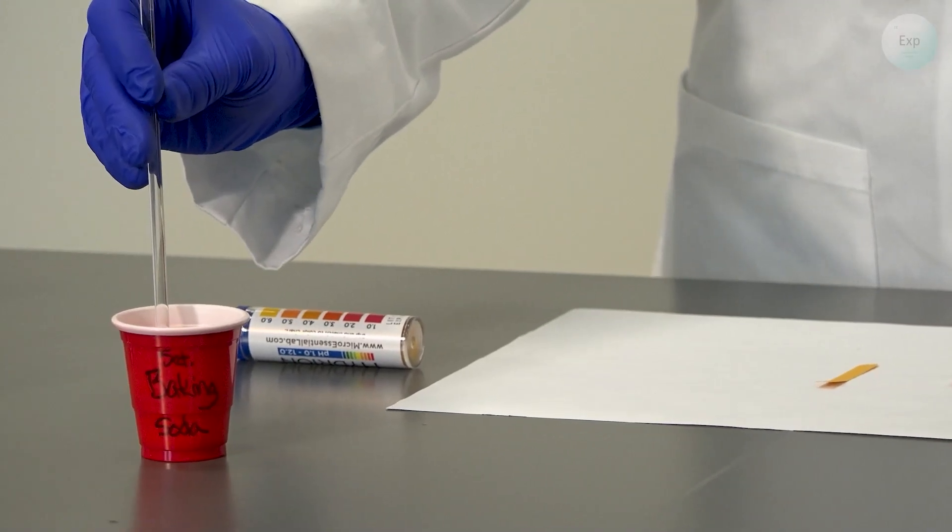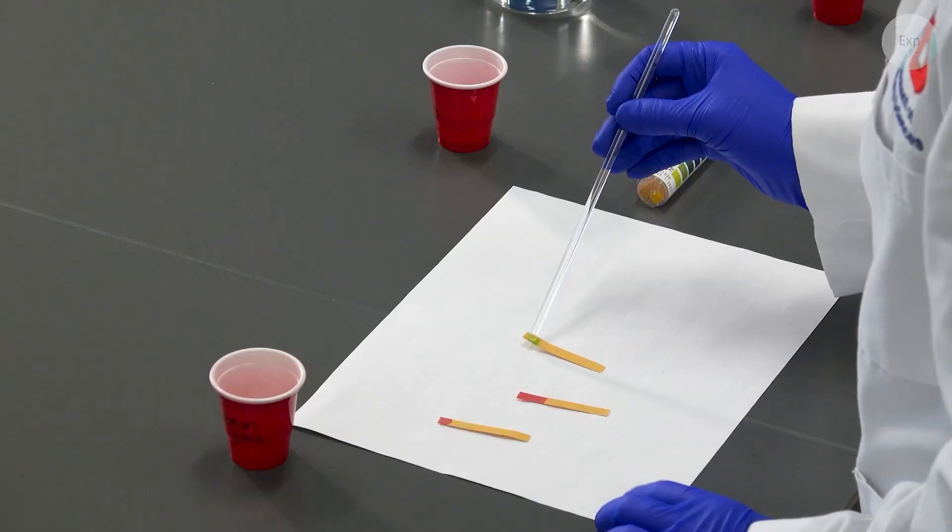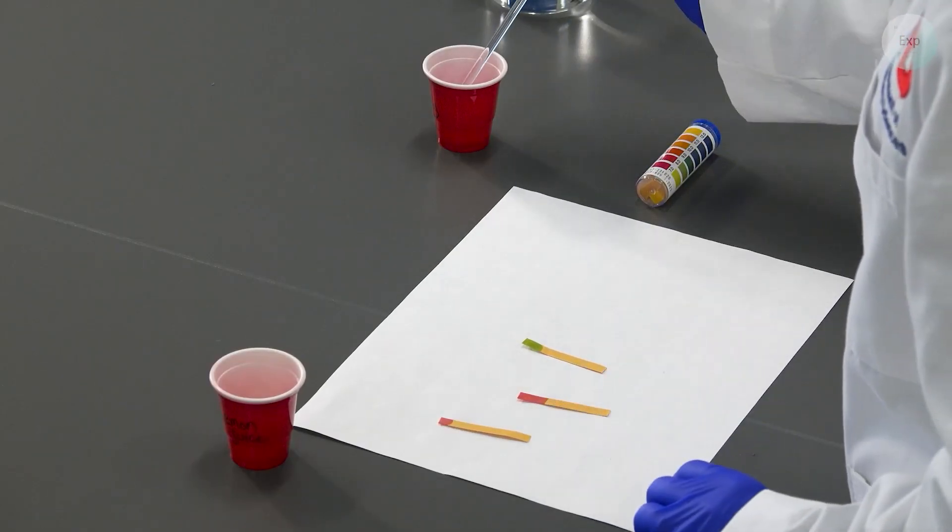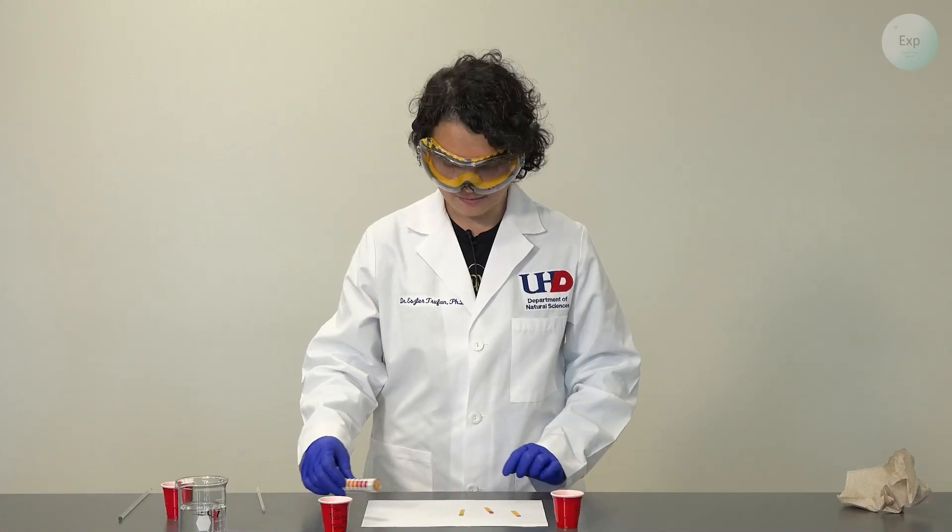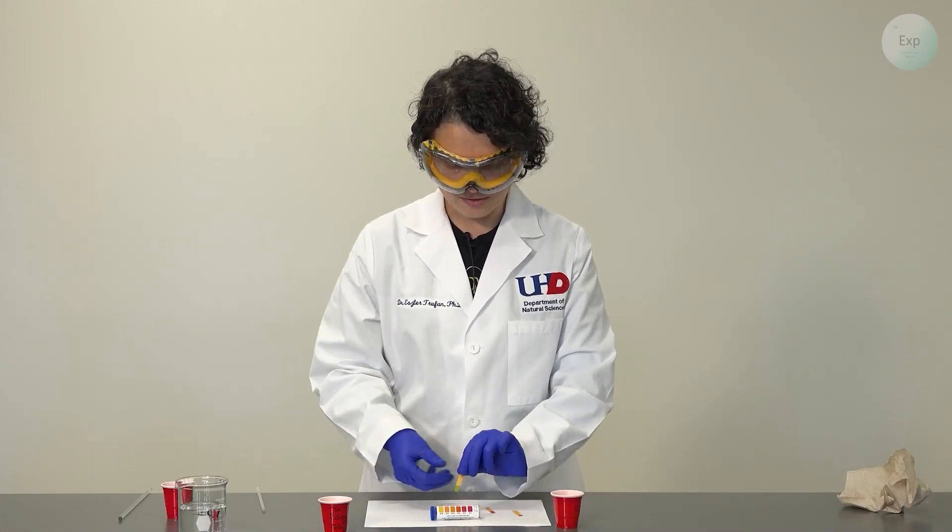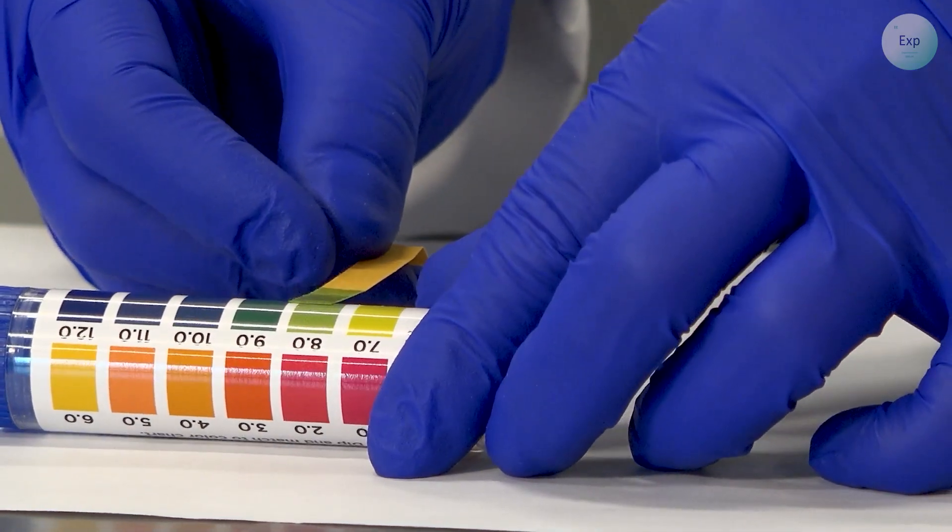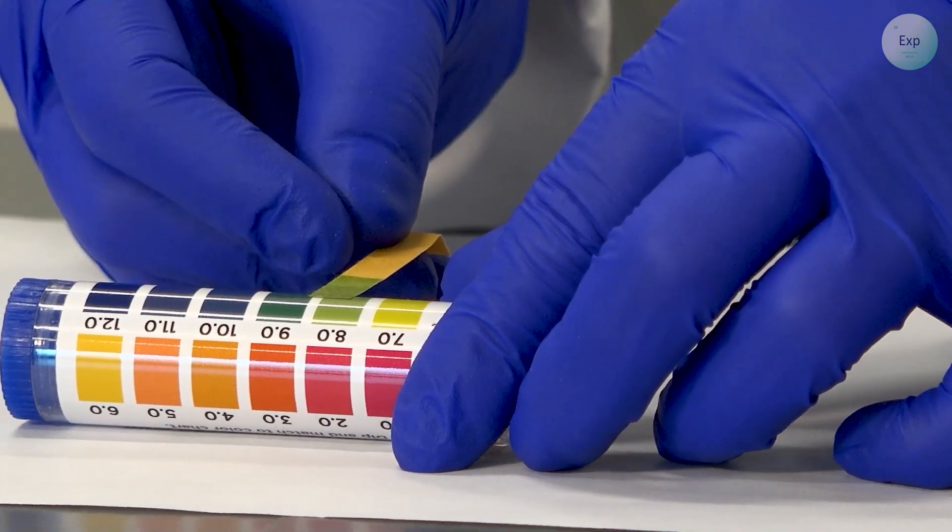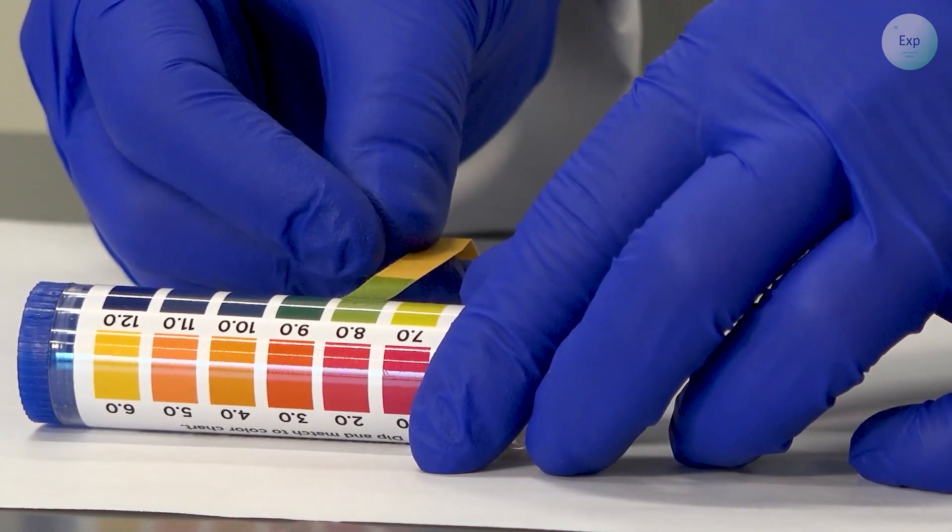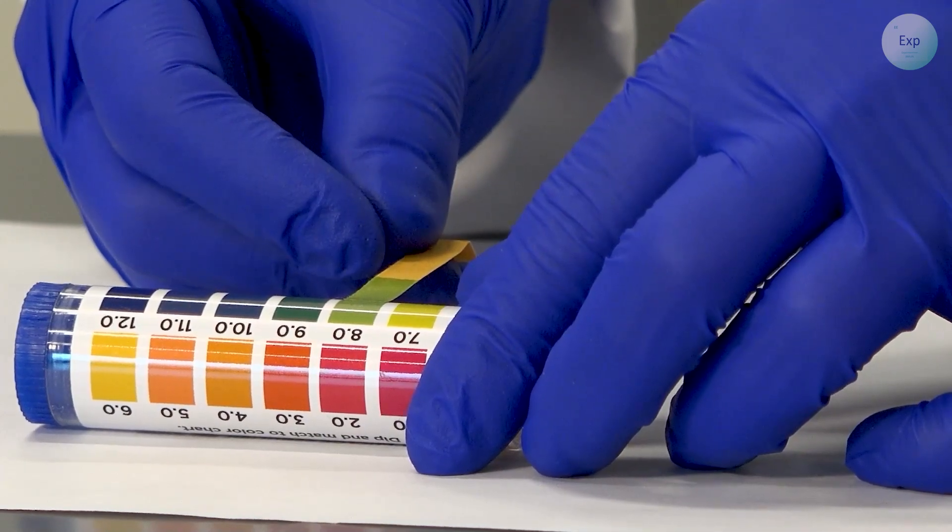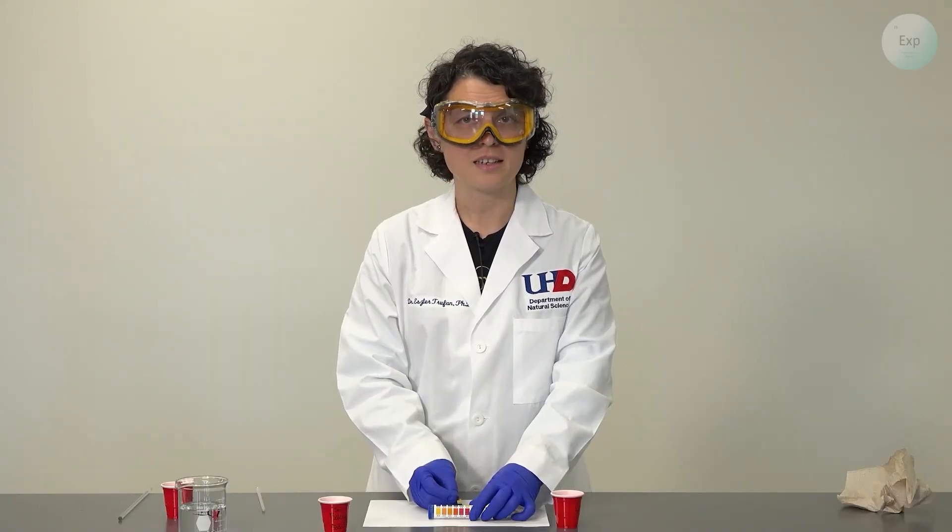We dip the stirring rod in there and then place a drop on the pH paper. Now we wait a little and then we compare the color response to the scale and in this case we see that the green color that was elicited is most similar to the pH of 8 on the paper. It may be between 8 and 9 but it is at least 8.